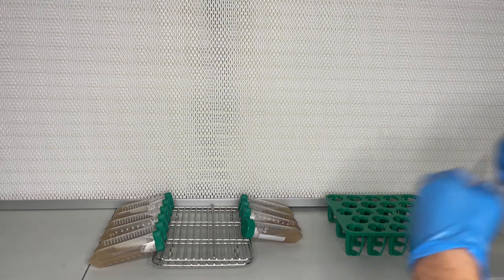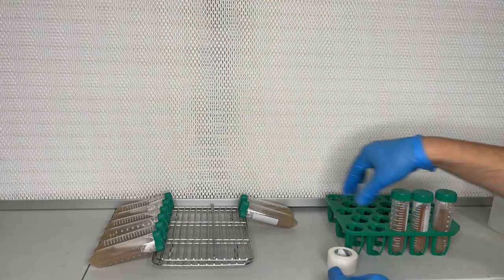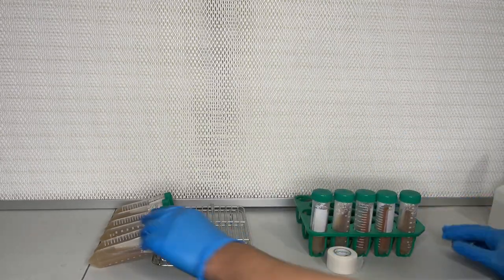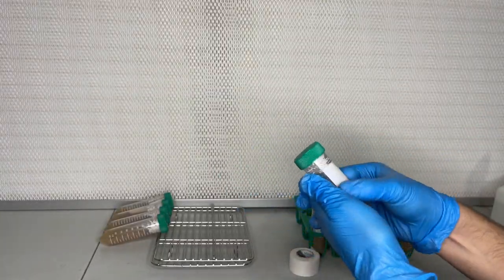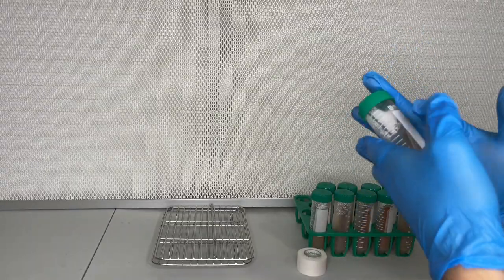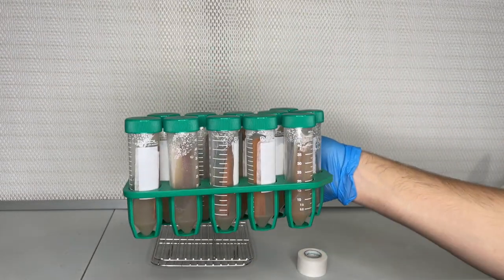I just put a piece of tape on each one, that way I can use a pen to write on them. You should let the culture slants sit at room temperature for at least 1 week to make sure they are clean before inoculating.